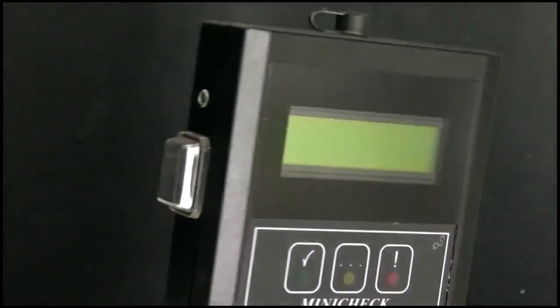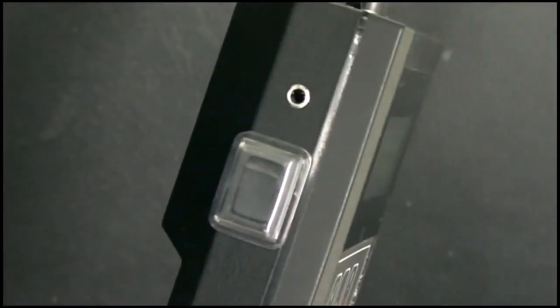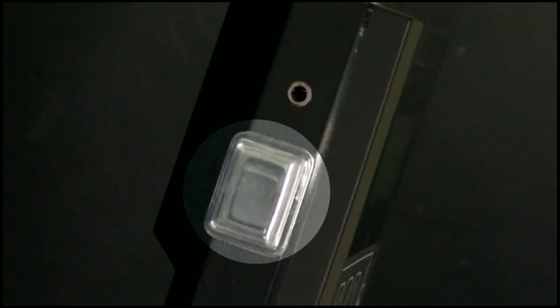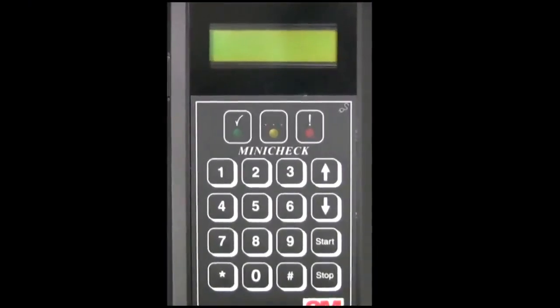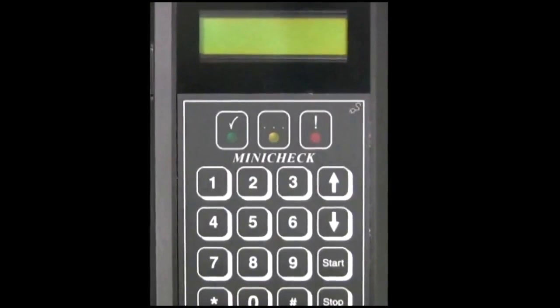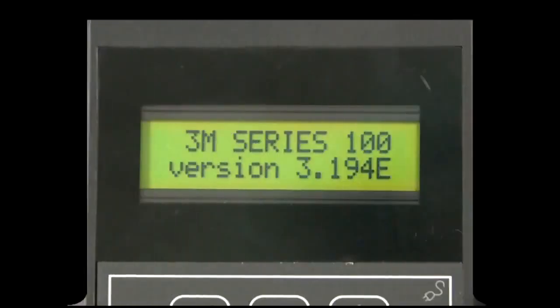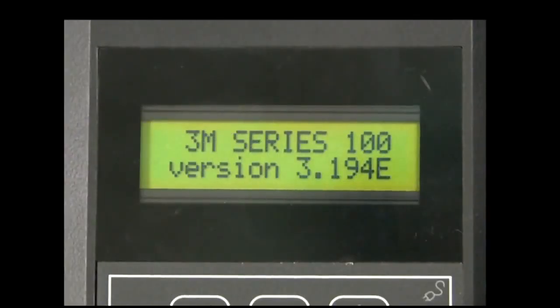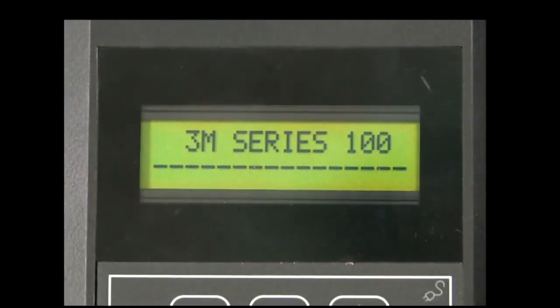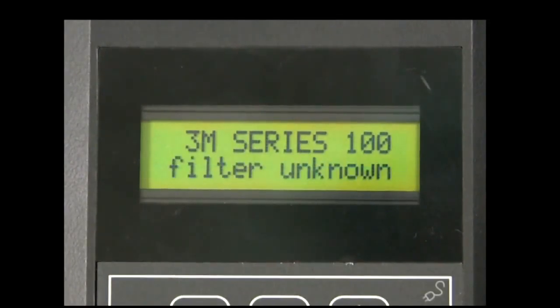The 3M Series 100 automated integrity test device is activated via the button located on the left side of the device. After this button is pressed, it requires approximately 5 seconds before startup information appears on the menu screen and it's verified the device is operational. Pressing the button again prior to the startup messages appearing on the display screen will result in the device being deactivated.